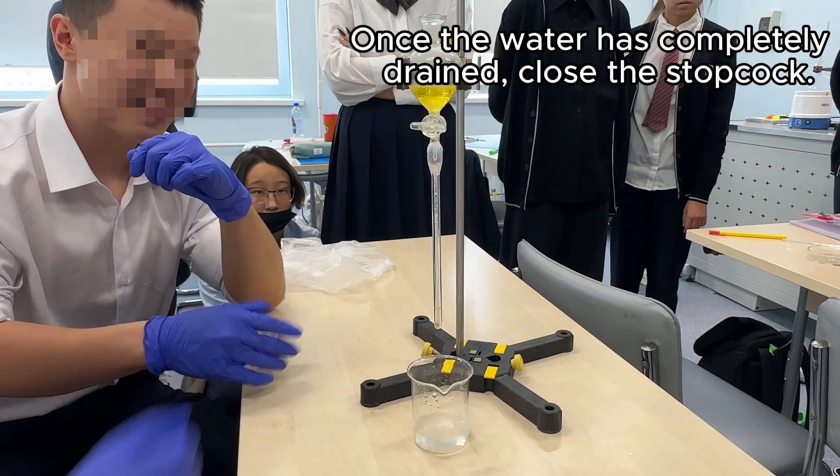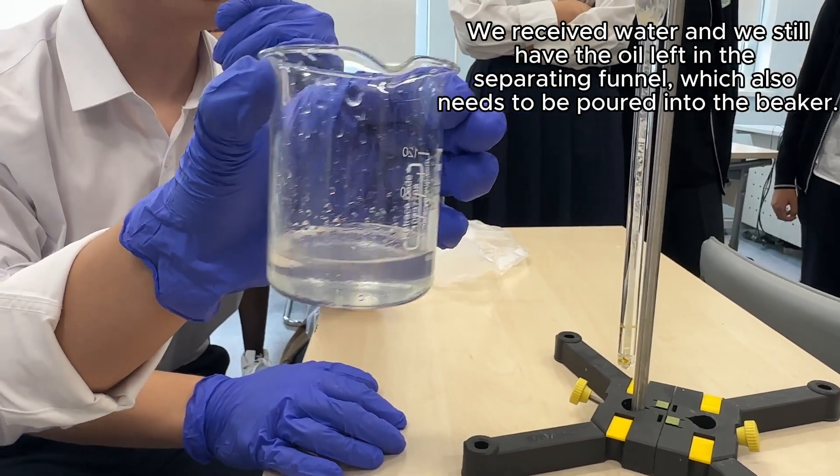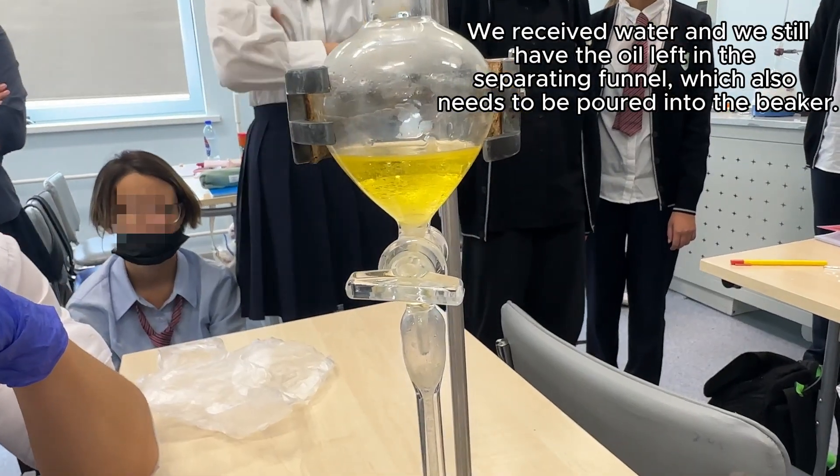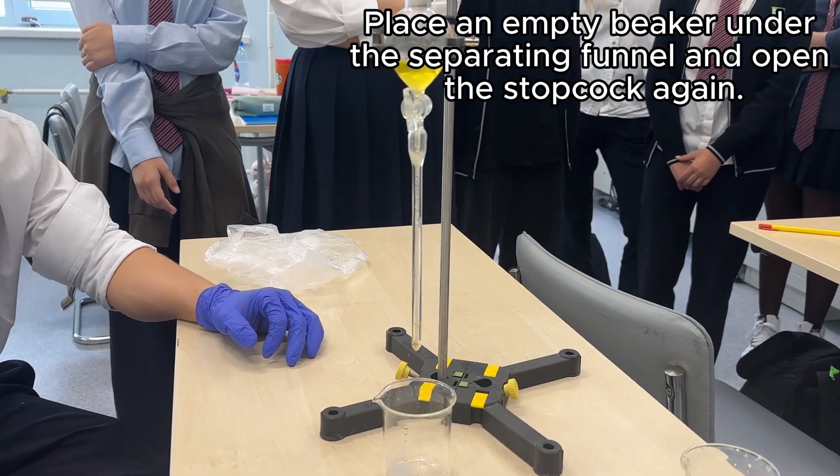Once the water has completely drained, close the stopcock. We received water without oil, and in the separating funnel we have oil left, which also needs to be poured into a beaker. Place an empty beaker under the separating funnel and open the stopcock again.